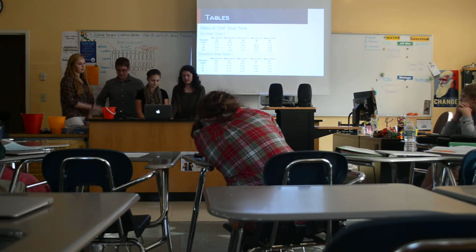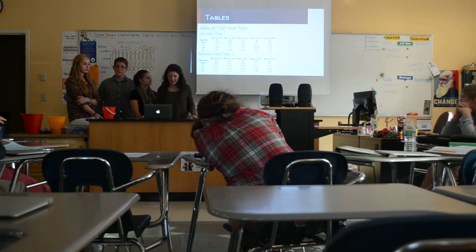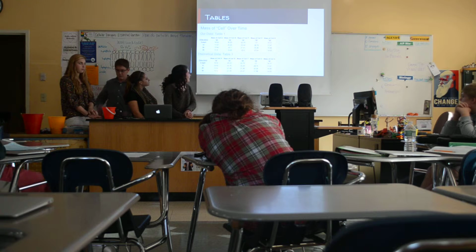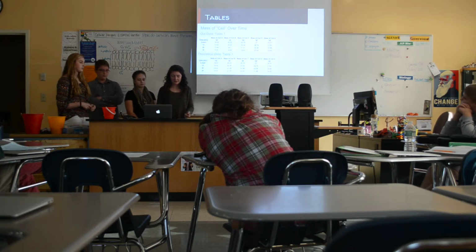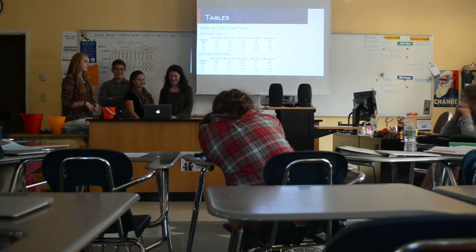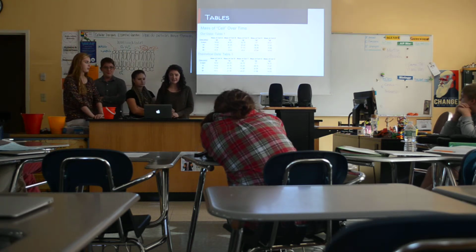So these are tables, and we tested over time. So our data was pretty wrong. So the second table is what it should look like. But in the first cell, cell A, the mass is supposed to stay the same because it's water inside the cell and inside the beaker. So it is dynamic isotonic. And then the other ones, depending on how much water concentration was inside the cell or outside the cell, the mass went up or down.